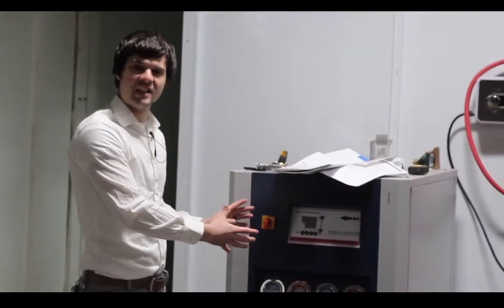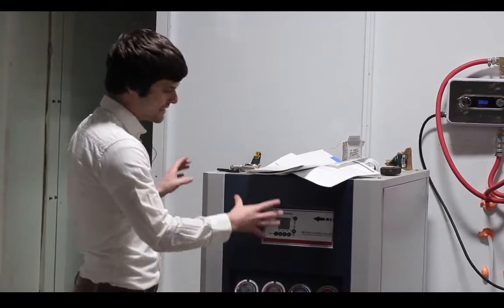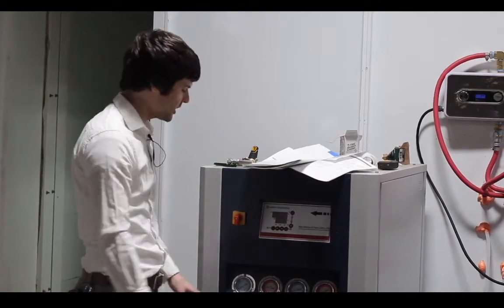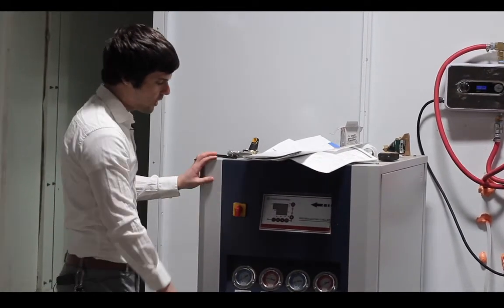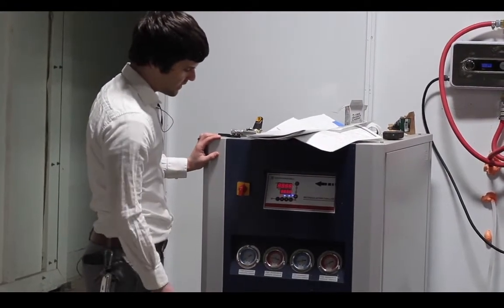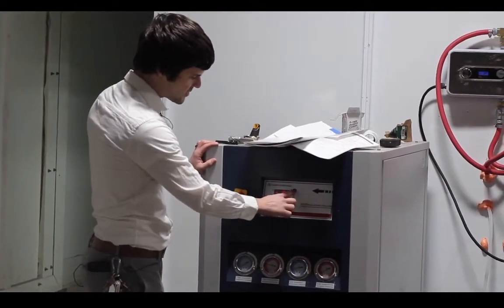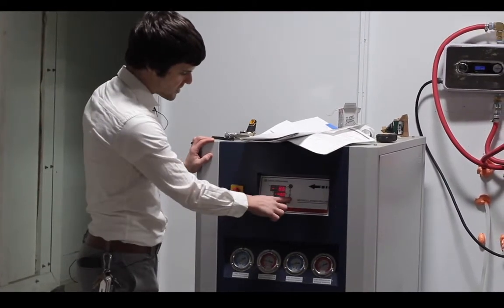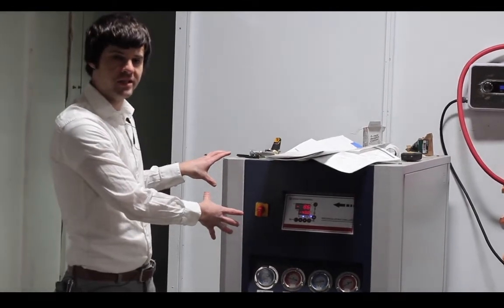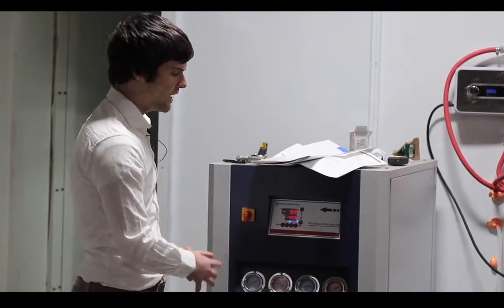These are our auxiliary chilling and heating units. And when we get here first thing in the morning before we can begin our extraction, since these are the units that are controlling the temperature parameters of our extraction, we want to come to chiller number one and we want to hit the power button. Give it a few seconds to initialize, then the circulation button, and then the snowflake button. So our parameters here are at negative 40 degrees Celsius. It will probably reach about negative 13 degrees Celsius in operation.